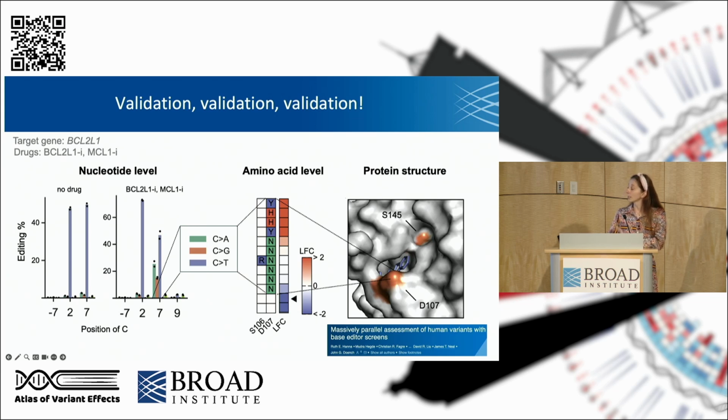However, there is a very small fraction of unexpected CBE editing patterns. And once we apply the small molecule treatment to the particular mutations introduced by this guide, we would see that due to the high selective pressure, the unexpected edits would progressively amplify in the screen and could also contribute to the resistance to a particular small molecule.